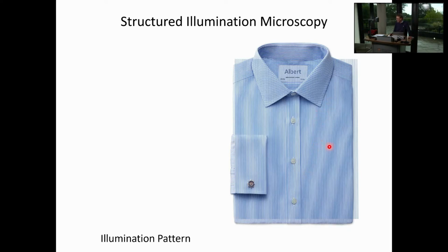Once you know what they are, you see them in nature all the time. You can see this when you, for example, have curtains folding over each other. So you can't see the fine pattern because they're too small when you stand far enough away. But when they sort of move against each other like this, you can see the beat pattern sometimes, and there appear these bands, like you see the bands here on this shirt.